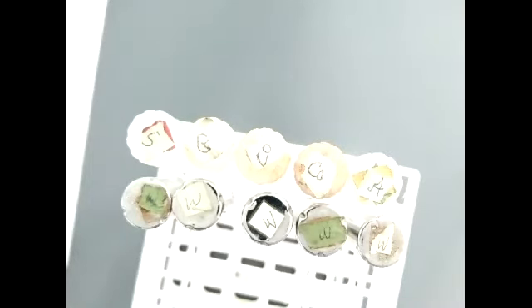We are back with exercise 4, chemical aspects. We are starting on page 53, and we're working on assignment 4. This is the identification of different kinds of biological molecules.